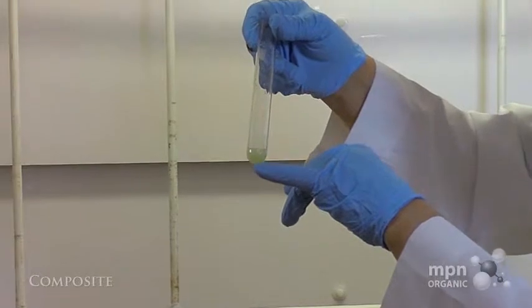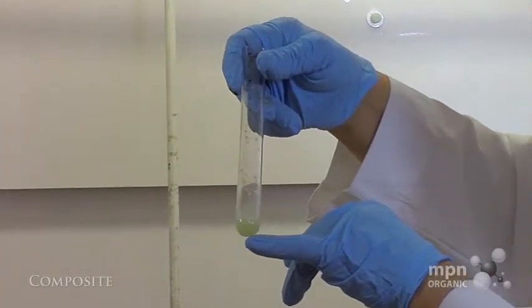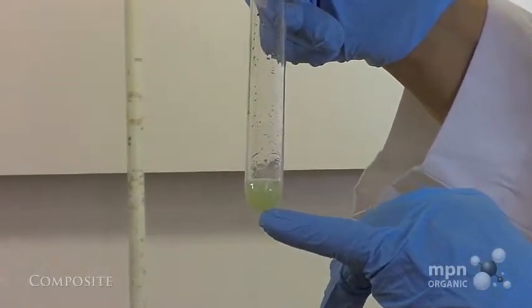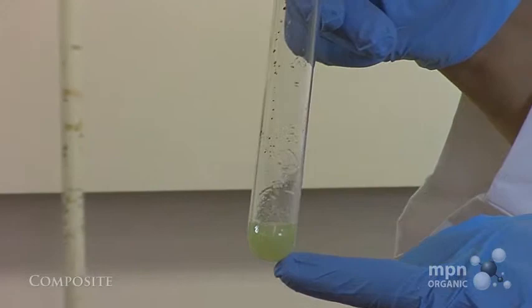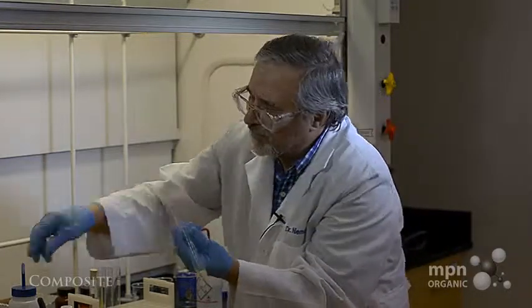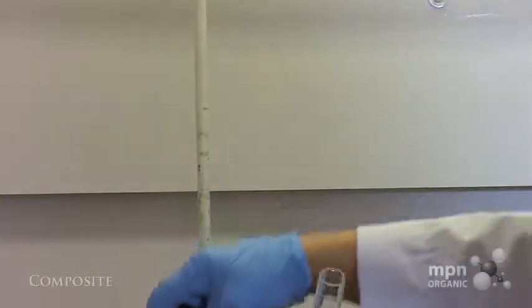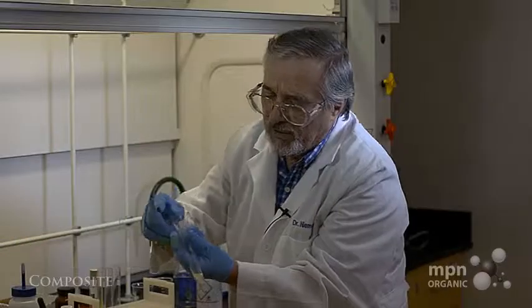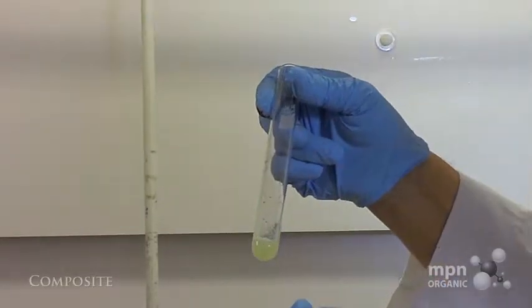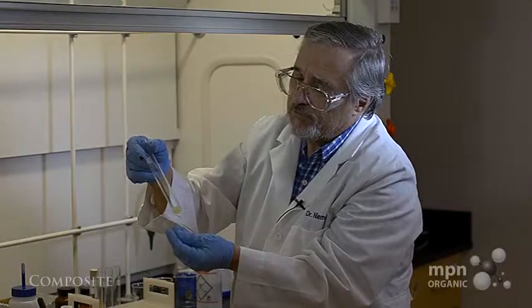Now if we let this stand long enough, we'll be able to then actually see that yellow solid here at the bottom of the test tube. But in fact, indeed, what we've done then is to convert this material to, first of all, a ketone by the oxidation with chromic acid. And we've been able to then show that this ketone is also a methyl ketone because it gives us a positive iodoform test.